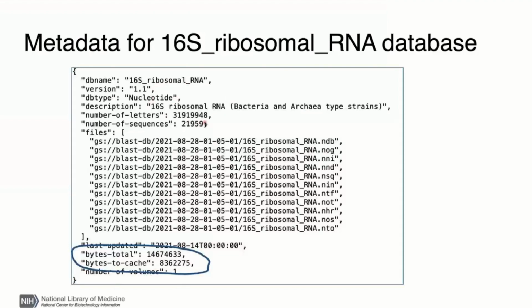This metadata comes with all NCBI provided databases. If you use your own database, you can produce the metadata with a Python script that comes with ElasticBLAST. Starting with our 2.13 BLAST Plus release, the metadata will get produced when you build your own database. We expect to ship 2.13 sometime in March now.